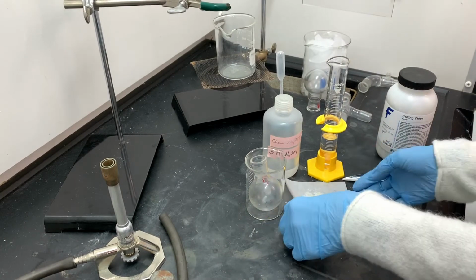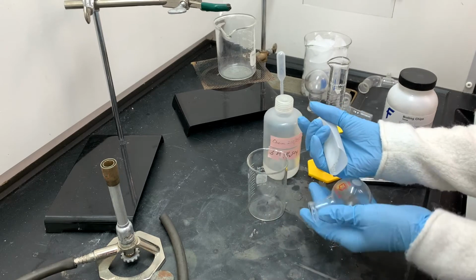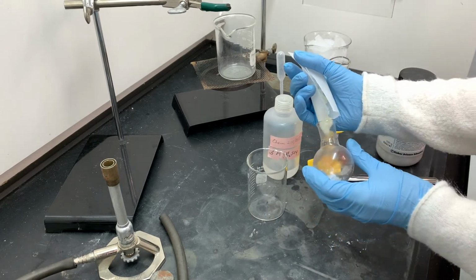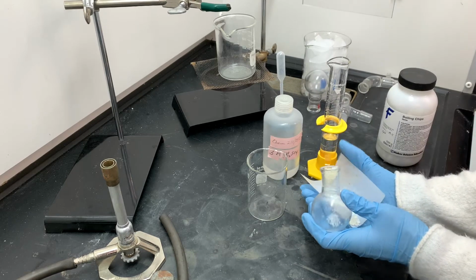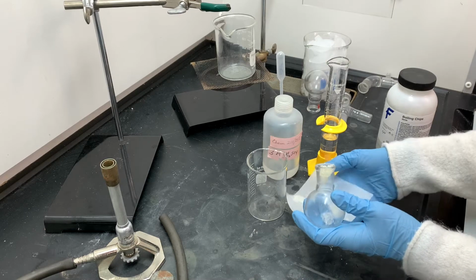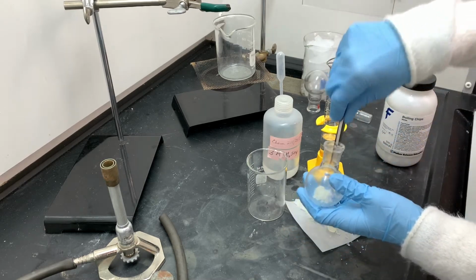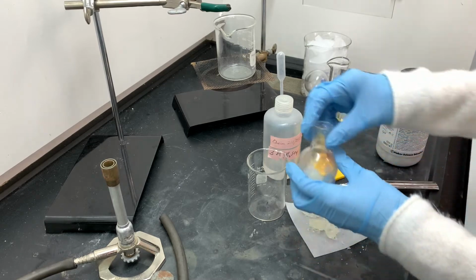Here's the approximately 7 grams of pinacol that I just measured out, and I'm going to transfer that into a 50 milliliter round bottom flask. If you recall, that pinacol was in really large chunks. I've already tried to break the chunks into smaller pieces, but as you can see, at least one of the pieces didn't get broken up into a small enough chunk to fit through the opening of the round bottom flask.